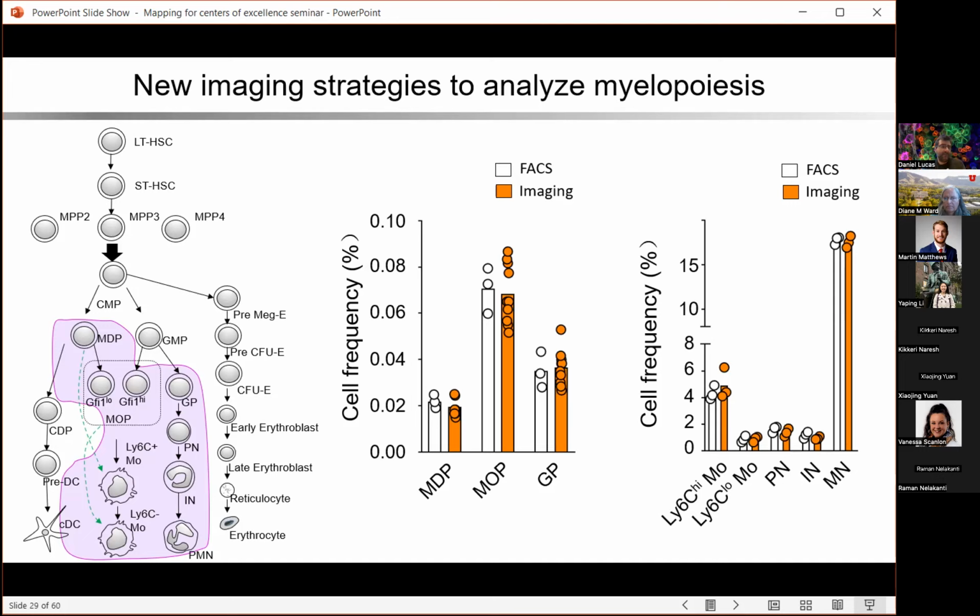were generated by historical reasons. People were identifying progenitors first as CD117 positive cells, and then they were throwing more and more markers on top of these original stains to fractionate the populations. But essentially, every population in the marrow can be defined in many different ways. And when you do that, you are always going to find 1 or 2 markers that you can use, even with fixation. Okay, thanks very much. No problem.